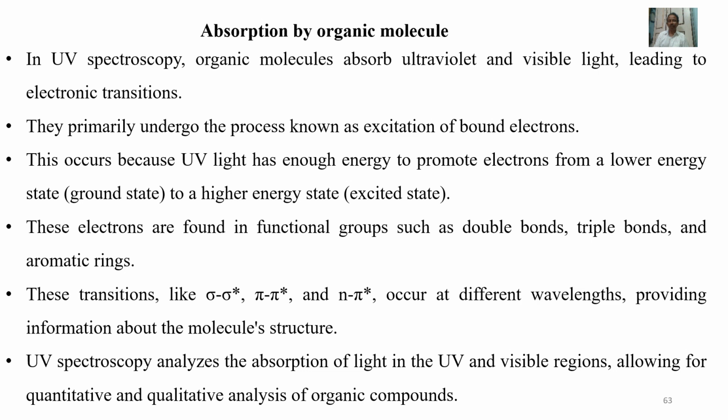UV spectroscopy is useful in the structure elucidation of organic compounds. The presence or absence of a particular absorption band at a particular wavelength may be regarded as evidence for the presence or absence of a particular chromophore in the compound.